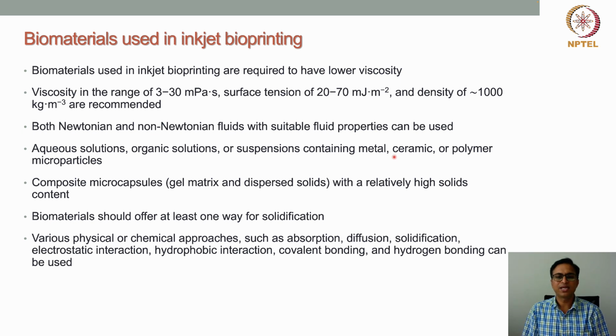And not only solutions, suspensions can also be used as a material for inkjet 3D printing.